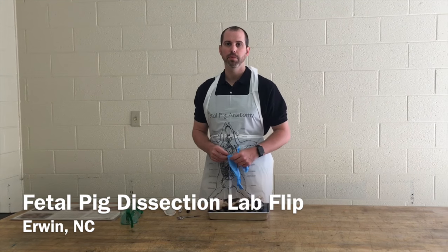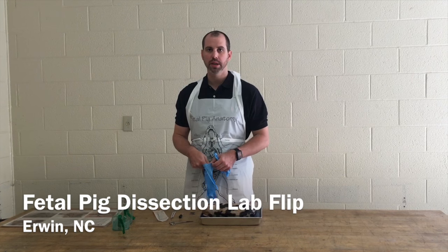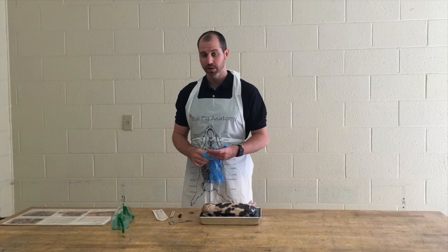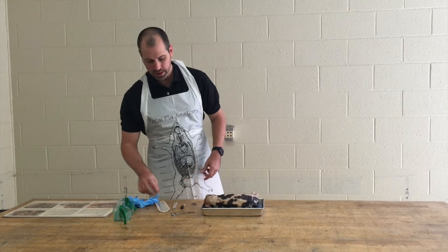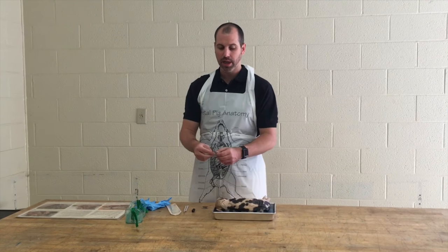Today we're going to dissect the fetal pig. The first step is to make sure you have all your safety equipment and all your other equipment that you need. Let's identify the tools we'll be using today for our lab.